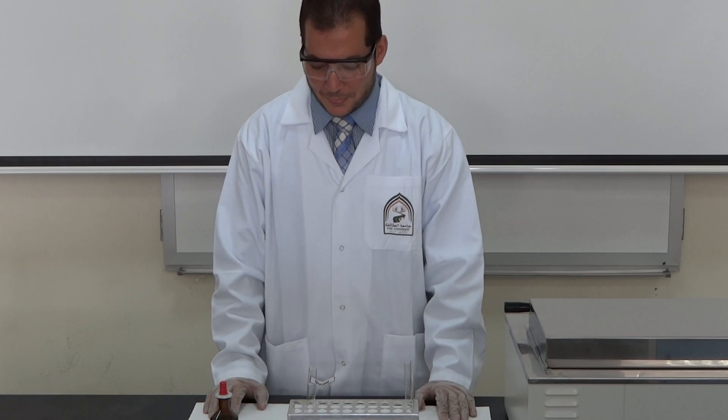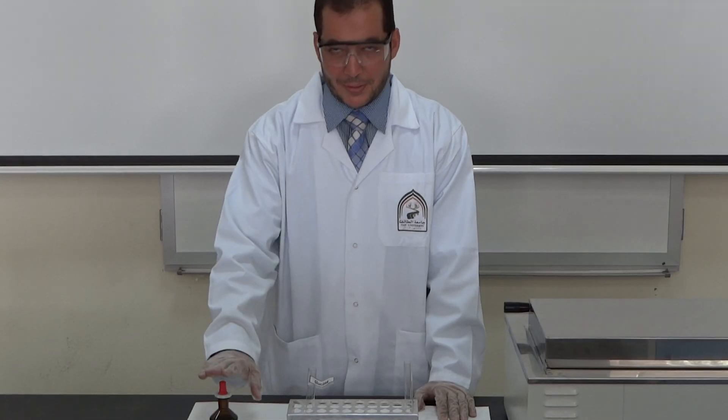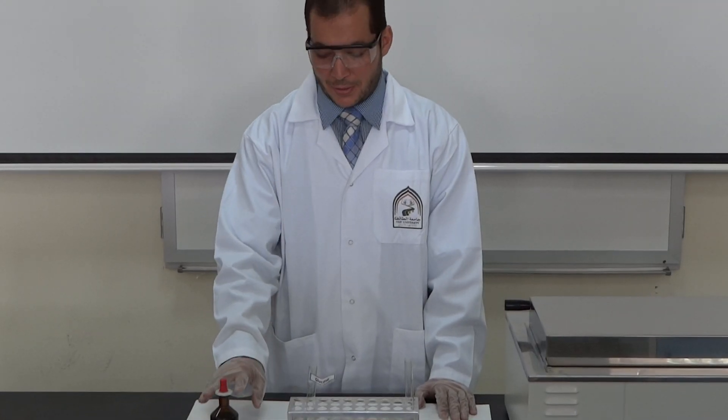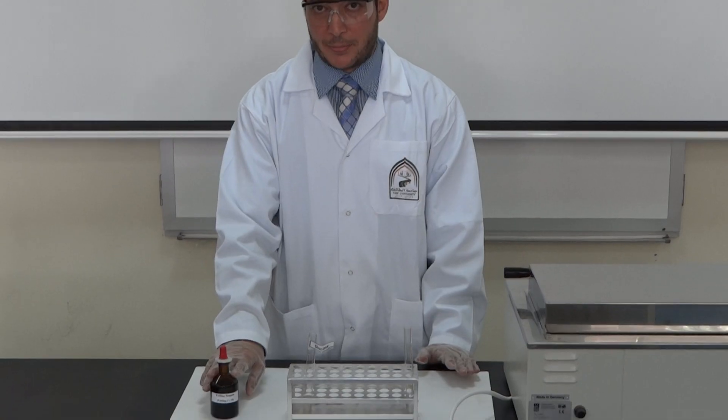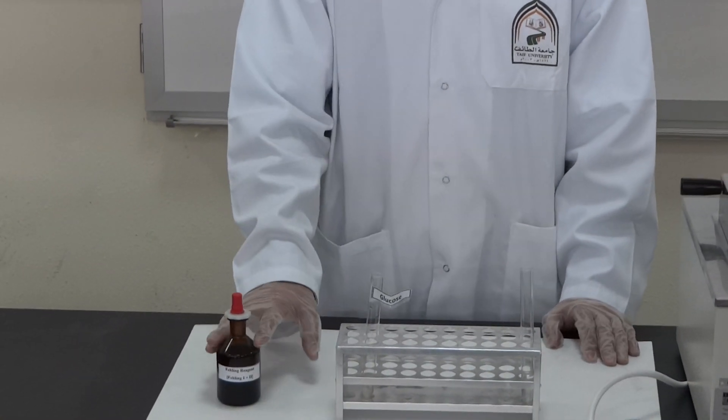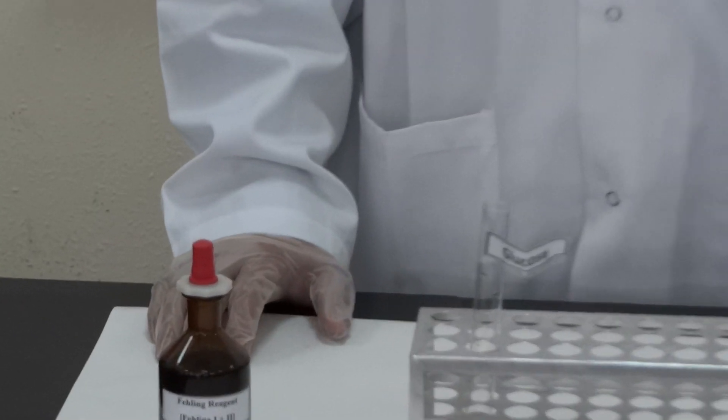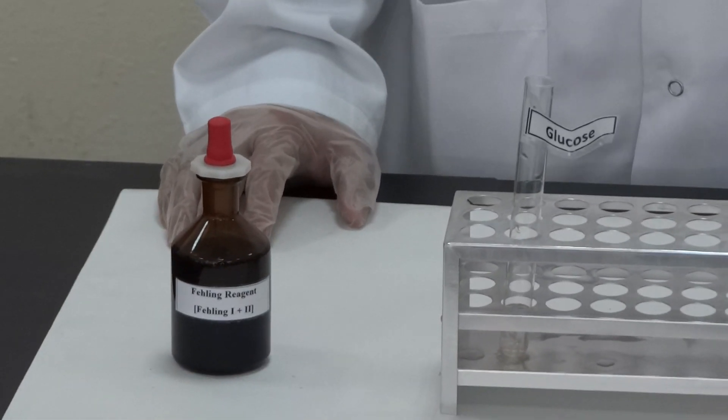Let's do Fehling's test. As we said, for Fehling's test we need Fehling's reagent, which is Fehling's A or B plus B, sometimes Fehling's 1 plus Fehling's 2, which is copper sulfate, and the other one is sodium hydroxide plus sodium potassium tartrate.